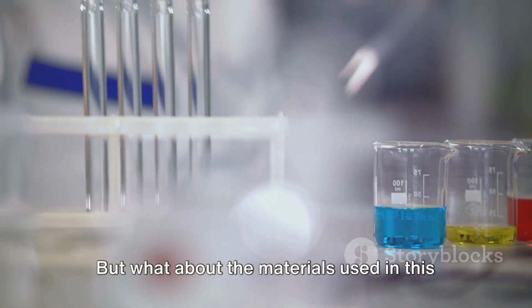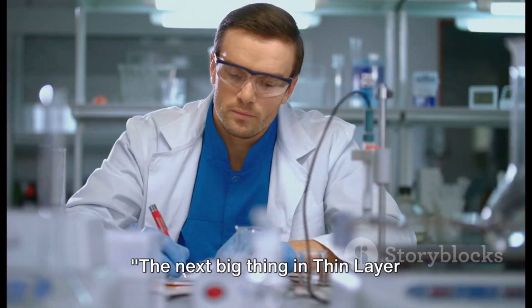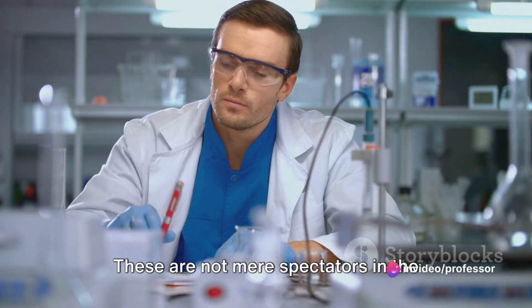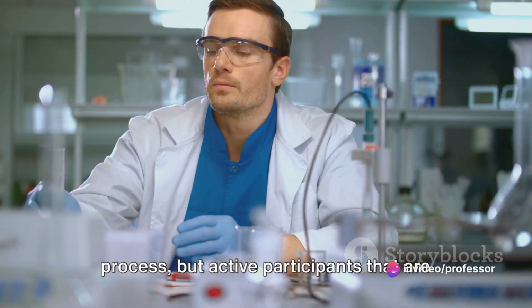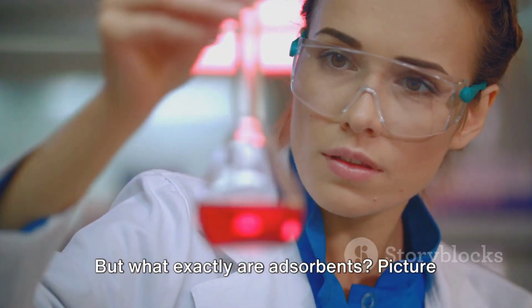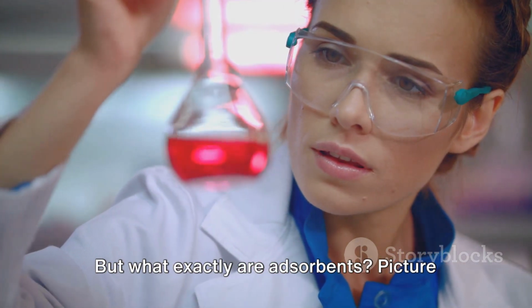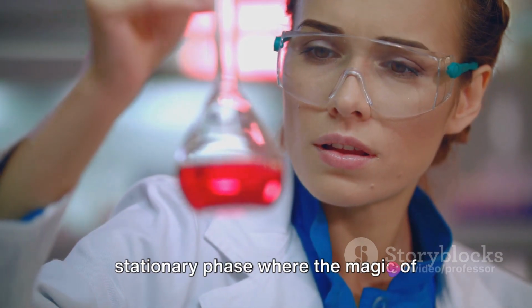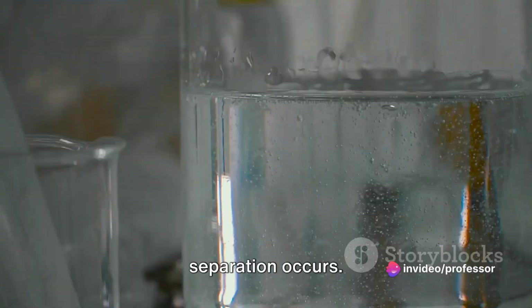But what about the materials used in this process? The next big thing in thin layer chromatography, or TLC, is the adsorbents. These are not mere spectators in the process, but active participants that are pivotal in the separation of compounds. But what exactly are adsorbents? Picture them as the silent heroes of TLC, the stationary phase where the magic of separation occurs.